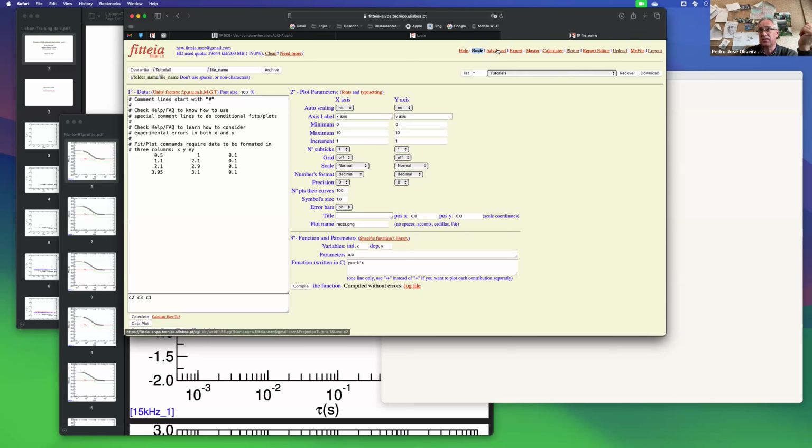So it can be advanced, or expert, or master. The word master does not represent exactly what you have to be. It represents only the flexibility of the system. In the master mode, you can have all the flexibility available in the system in one layout.